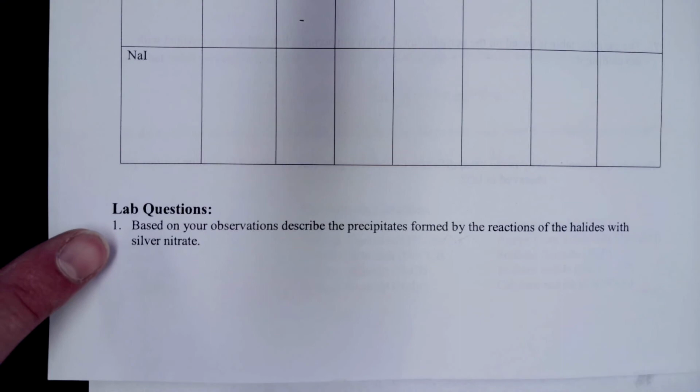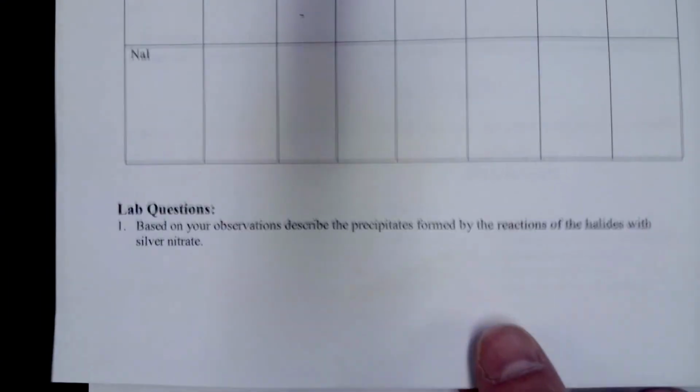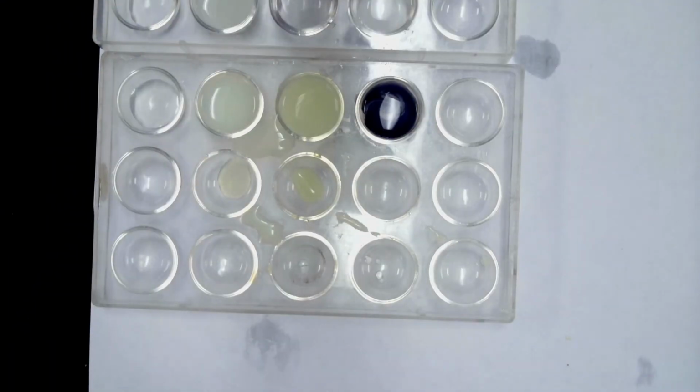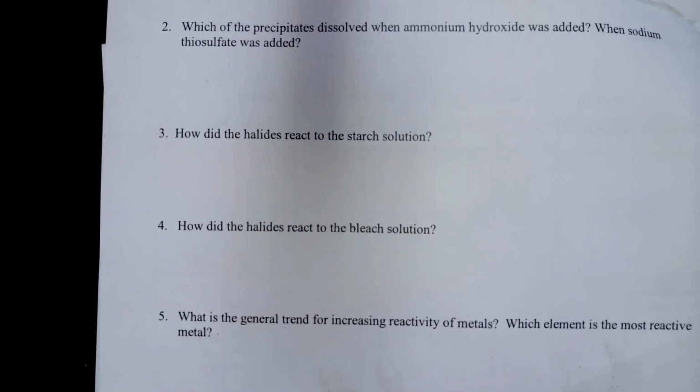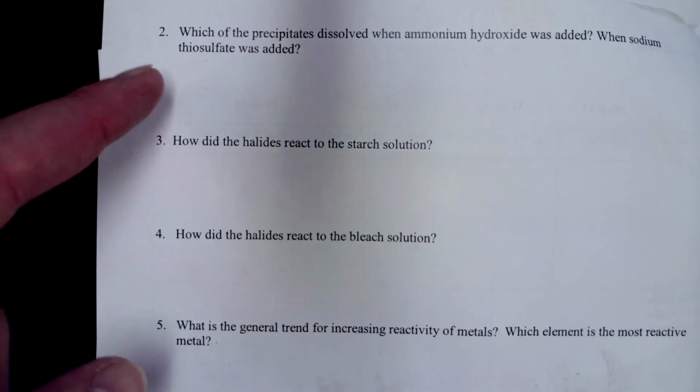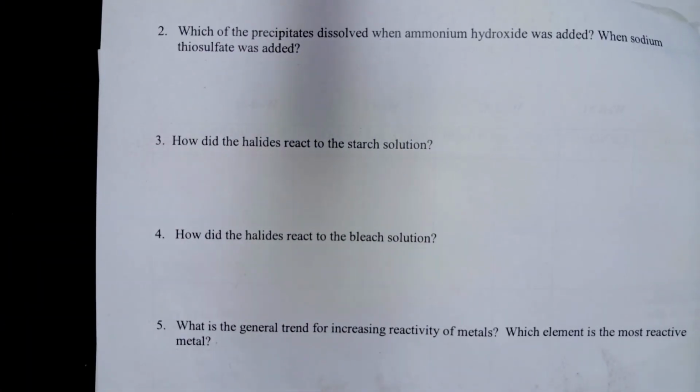And then at this point, just do the lab questions. Most of them just say, hey, what did you observe? Just go back, check your data table, record what you observed. Some of them go over the trends, so you got those in your notes. So at this point, just make sure you finish all the questions.